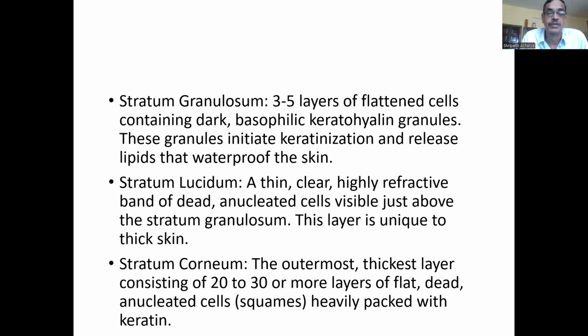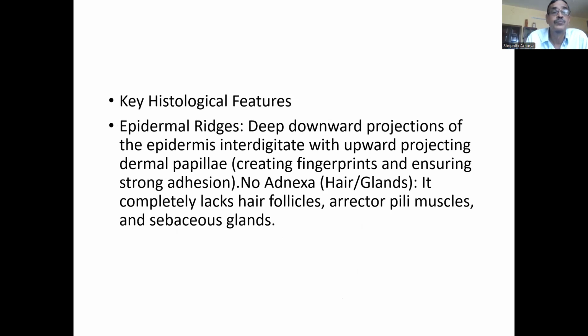Stratum corneum, the outermost, thickest layer, consisting of 20 to 30 or more layers of flat, dead anucleated cells, squames, heavily packed with keratin. Key histological features. Epidermal ridges: deep downward projections of the epidermis interdigitate with upward projecting dermal papillae, creating fingerprints and ensuring strong adhesion.